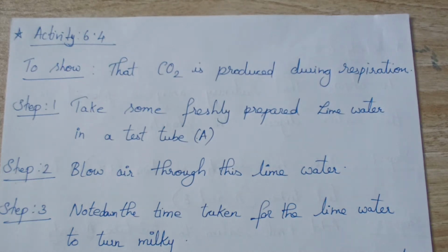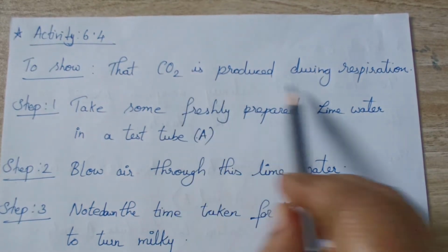Hi dear, today we will see activity 6.4. What we are going to show in activity 6.4 is that CO2 is produced during respiration.